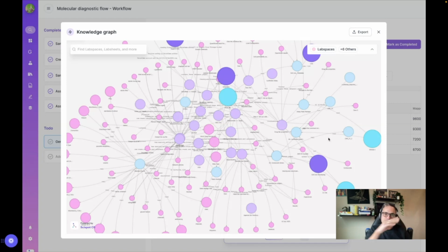And what this does is it shows you the chain of custody in a knowledge graph as well, which is super useful because a lot of customers mention, hey, I have to run SQL queries to find the information, or I have to hit this API endpoint and then slice and dice the data to be able to see what sample was linked with what run, what experiment run, how it was sequenced, what instrument it came from. So there are a lot of questions that folks go through, and the idea of graphical ontologies is, can we connect all of that together? Can we bring that data into one chain of custody?